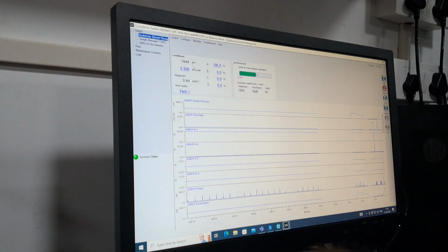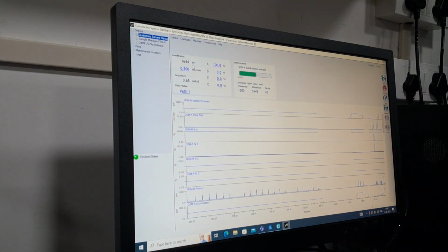We'll sit together and make a spec sheet and print it. The specifications also we'll make a printout: injection volume and temperatures, okay?